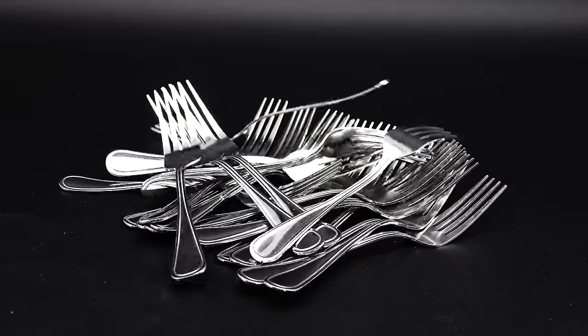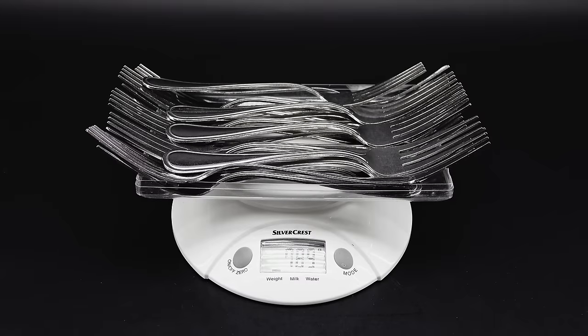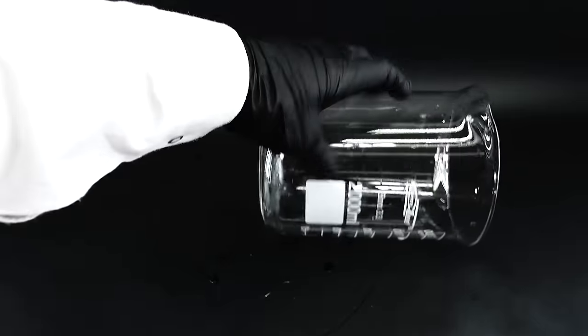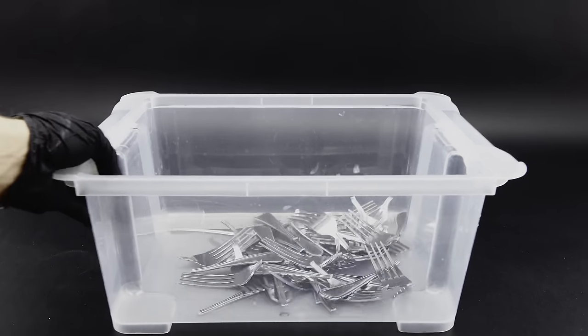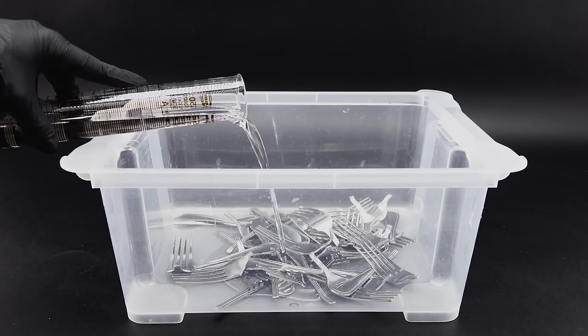To dissolve all my forks, I first weighed them all — a whopping 789 grams of fork matter, which makes this a really large scale project. Before adding the acid, I used my hands to tear every fork into two pieces, mainly because it was really cool to do and slightly increased the surface area. For the next step, I couldn't just use a good old beaker, and instead settled on a big plastic container. My advanced mathematical calculations led me to need a whopping 920 milliliters of sulfuric acid — about 1.5 car batteries worth — and I added just 250 milliliters to start.